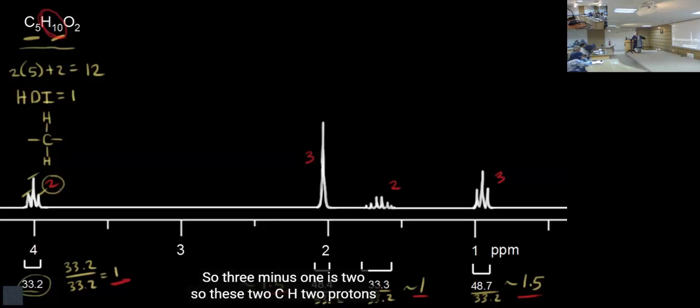Okay, looking at this, I request Hani to come forward to the board and draw whatever constituent you are observing. Yeah. No, we will discuss. We are not just doing further.